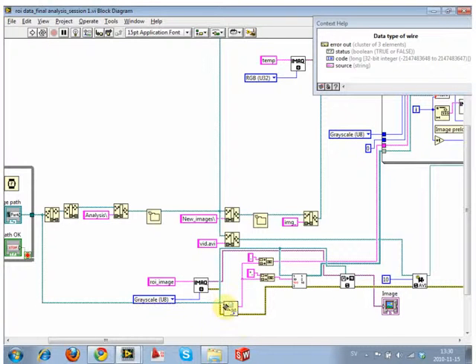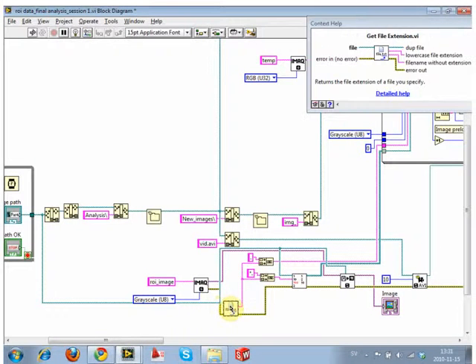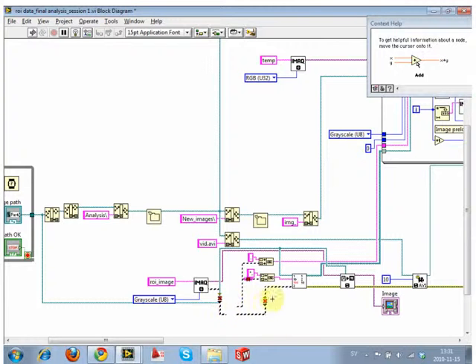So that's a good reason why not to hit Control B. Because if I hit Control B there, then it deletes wires that I don't want to delete. You're best off figuring out where they are. See, right now I know it's just deleting this section, so that's fine. Now we can wipe this guy out.